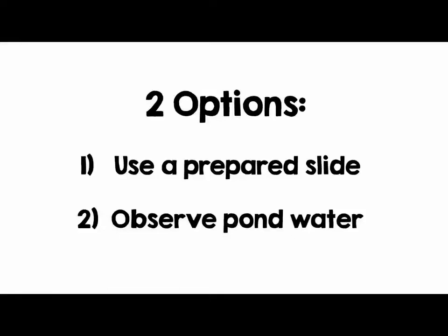Okay, in today's lab we're going to be looking at protists and specifically protozoans, and those are the animal-like protists. And you have two options for today. You can either use a prepared slide, which is what I'll be doing, or you can observe your own pond water.